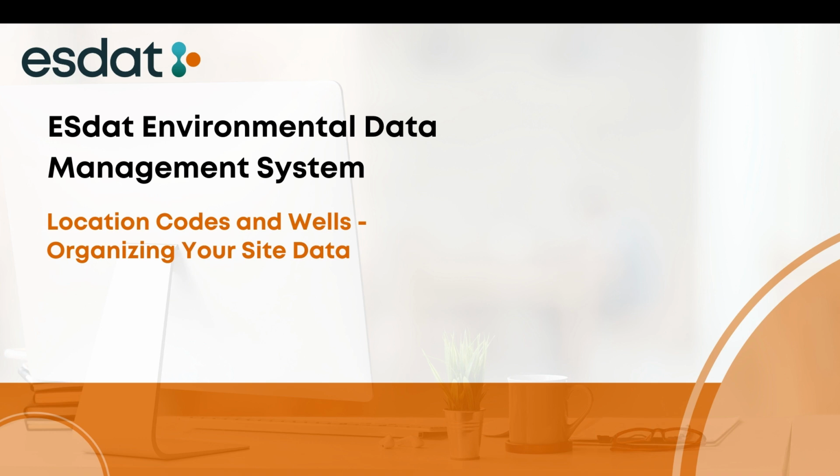In this video, we are going to cover the concept of location codes and wells in ESDAT. We will explore why they are important and how to add location codes into ESDAT, individually or in bulk.